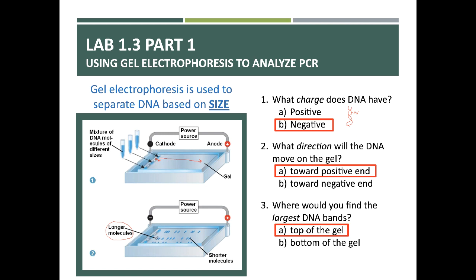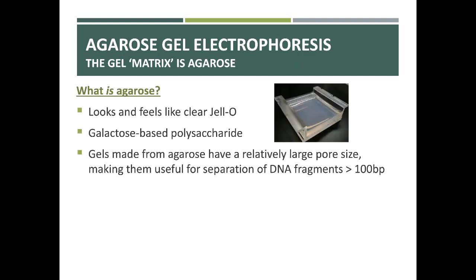However, larger molecules are going to be found near the top because they cannot move through the gel as quickly. So what is the gel made of?